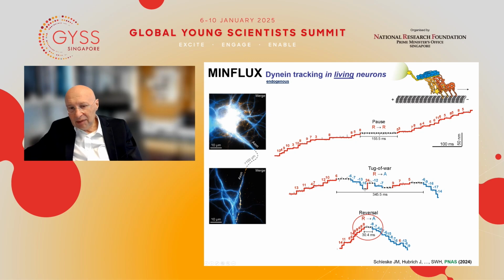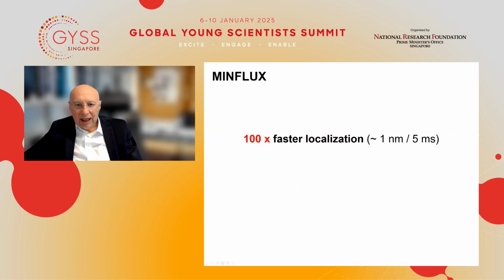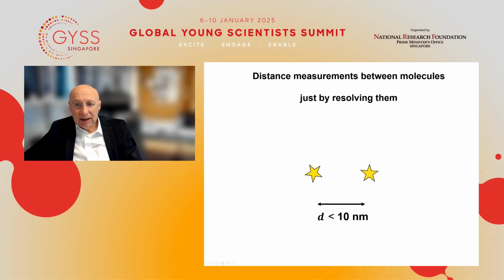And let's assume I was 30 years younger or something, then I would probably go into this field because many things can be discovered now due to the fact that there is a fundamentally new tool at hand. So not only can we be 100 times faster, we are also 10 times more precise. And this really makes a difference because the precision becomes now so good that we can really look at distances between molecules that are really at the molecular scale.